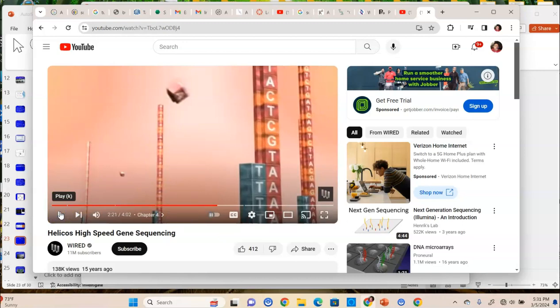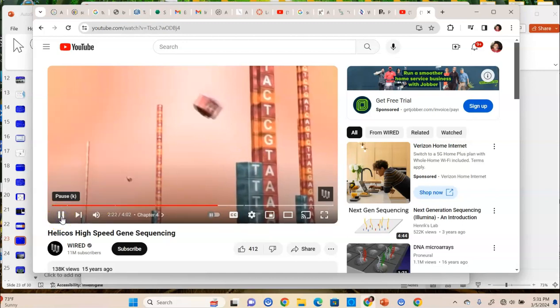So I hope that you can hear what's on the screen. If not, you might have to play the videos. I was trying to see if that setting was on, but anyway, so we have a T, and this poly-T is going to serve as the primer, right? So all we need is a double-stranded region and then a free 3' hydroxyl. So this is the 3' OH right here on this end, into the primers.